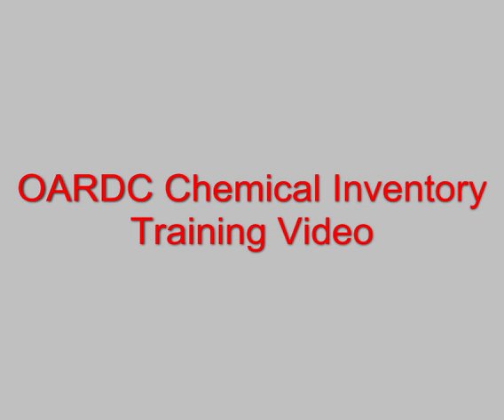Welcome to the OARDC Chemical Inventory System training video. This video will help familiarize you with the basic features of the system. The OARDC Chemical Inventory System is web-based.